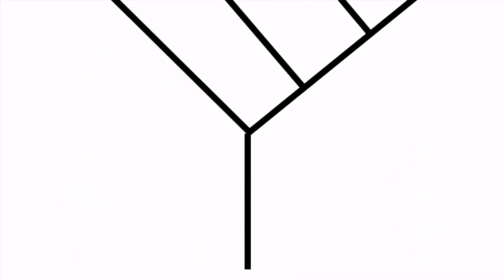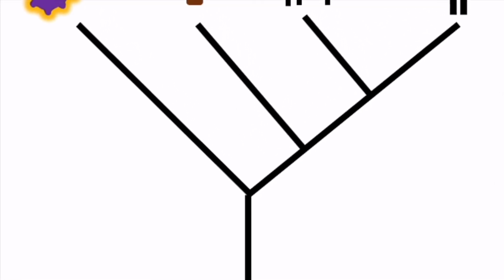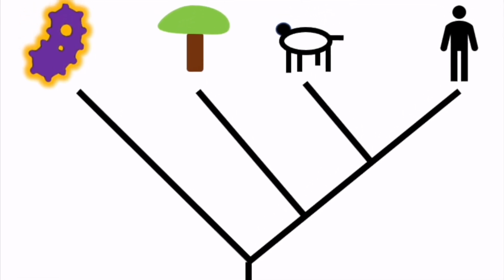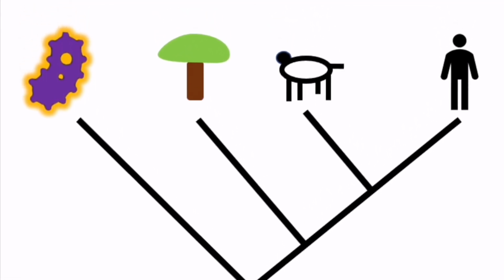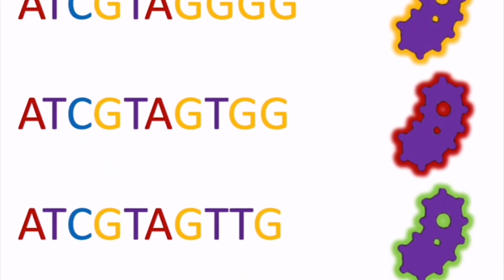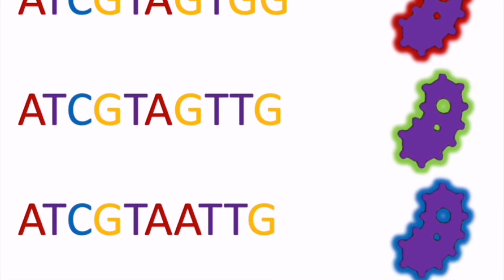Now, for our DNA extraction, every living thing is related to every other living thing, whether distantly, like humans and bacteria, or closely, humans and chimpanzees. We can use this relatedness to compare different orders of A, T, C, G in our DNA, and find out what species we have, without checking them under a microscope.